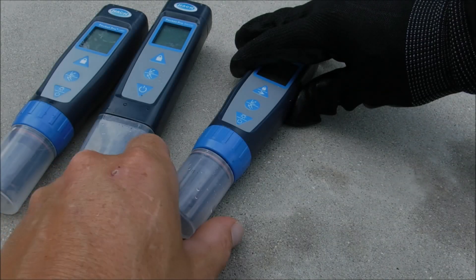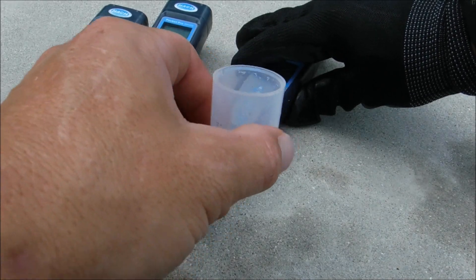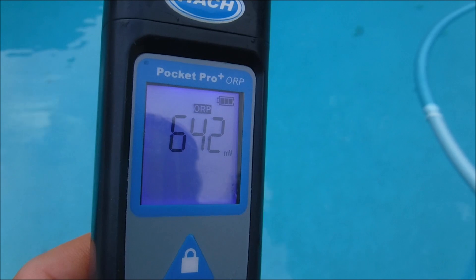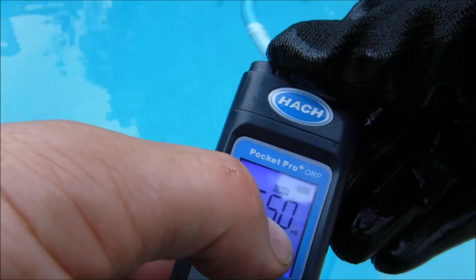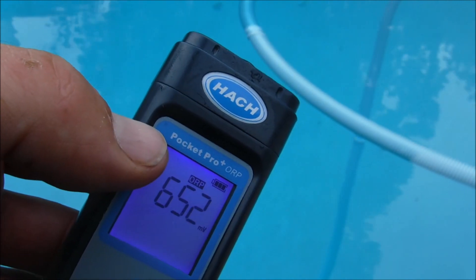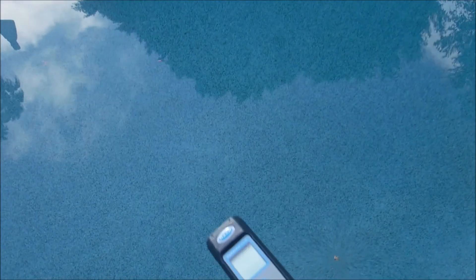The Pocket Pro testers are very easy to use. The cap is also where you would get the water sample — go ahead and fill it to the fill line, then simply insert the tester into the sample. The screen is really easy to read, and there's a battery meter on top. When that starts to flash, you have 10% battery left. The testers are also waterproof and they float.